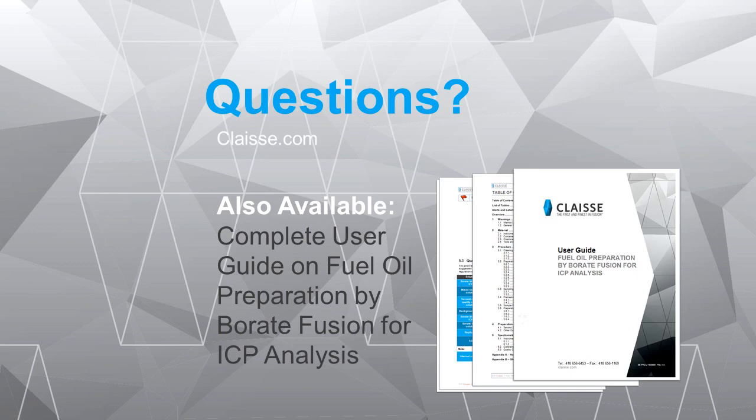First question, what are the advantages of using a flux made of lithium metaborate lithium bromide instead of the lithium tetraborate lithium fluoride stated in the ASTM? I would say there are many advantages. First, since there is no fluoride in the lithium metaborate lithium bromide prefused Claisse mixture, silica will not react to transform into tetrafluorosilicate, which is a volatile compound. So using the lithium metaborate lithium bromide will help you get 100% recovery of the silica in the sample, thus giving you a more accurate result.